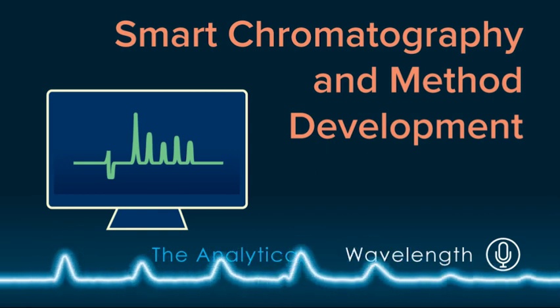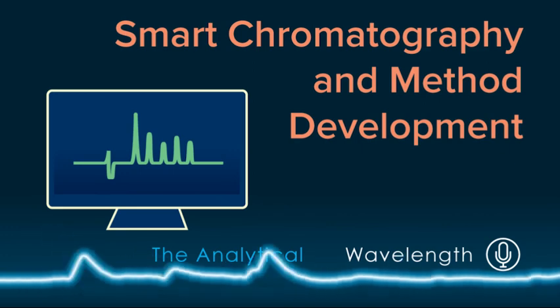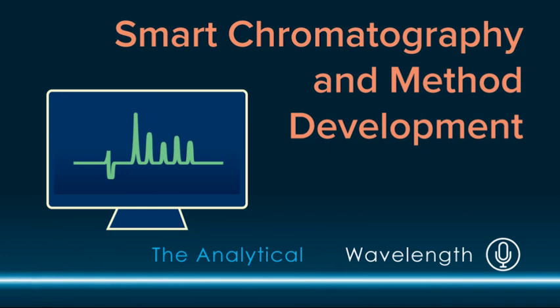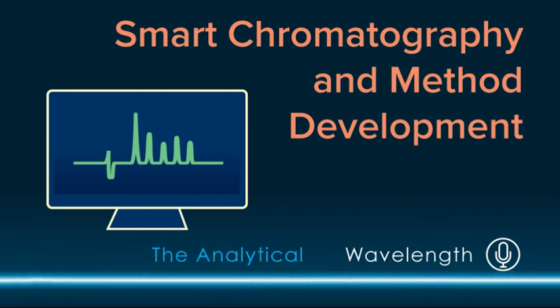But where chromatography development can really be helpful and beneficial is maybe enabling you to arrive at more robust conditions, so that you can focus on the robustness because you know more information about your system than just focusing on getting to adequate conditions. So maybe it'll improve what we do in terms of method transfer and allowing us to have high quality methods. My hope is that it goes for not just small molecule, but every mode of chromatography that is important for release testing for whatever that application is.